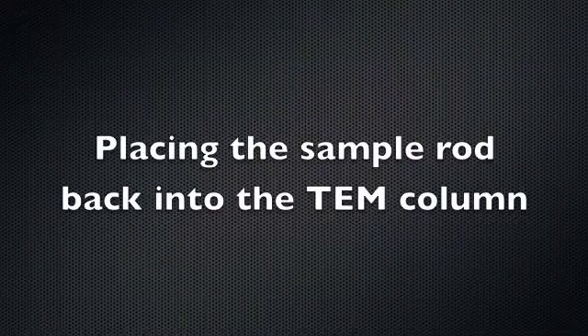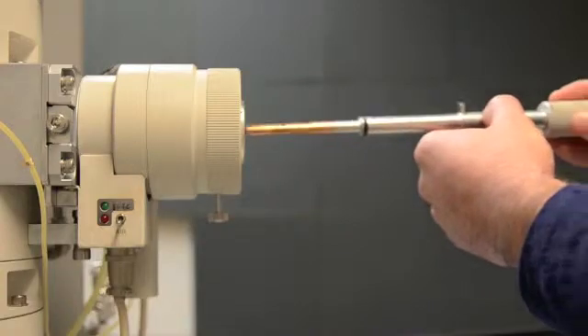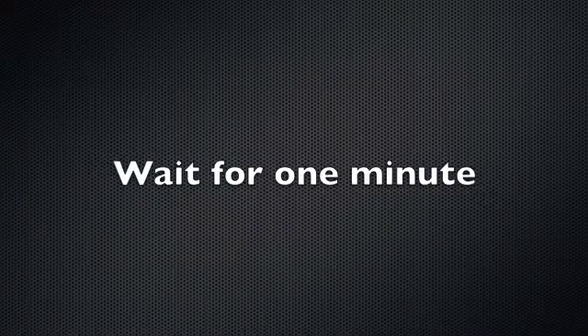To place the sample rod back into the TEM column, push the rod straight into the stage until it stops — you will hear a click. Then flip the switch back to evac and wait until the light turns from red to green; it takes about a minute.